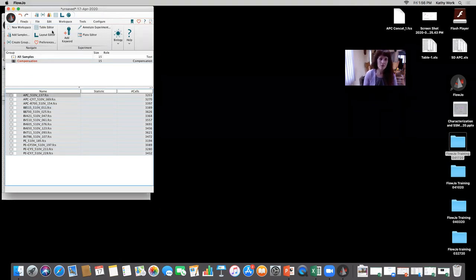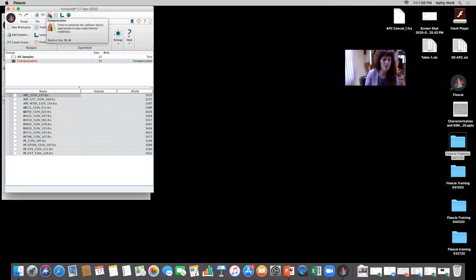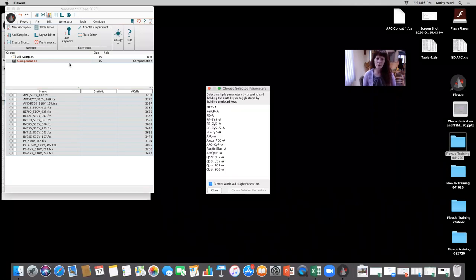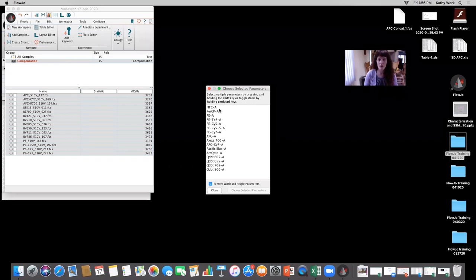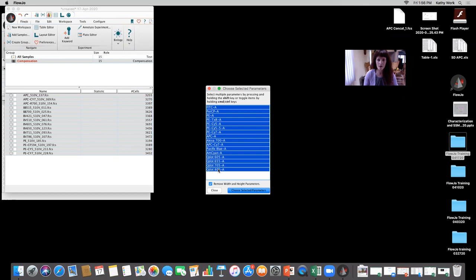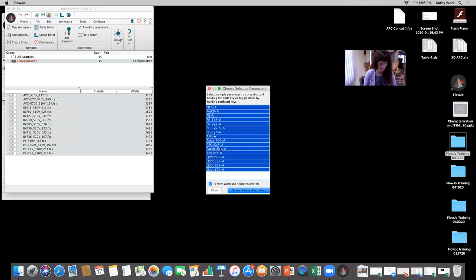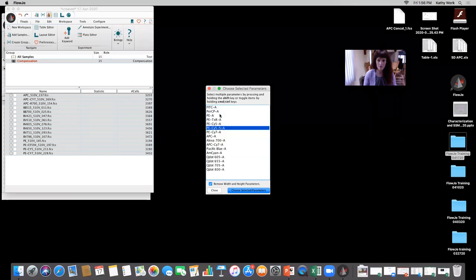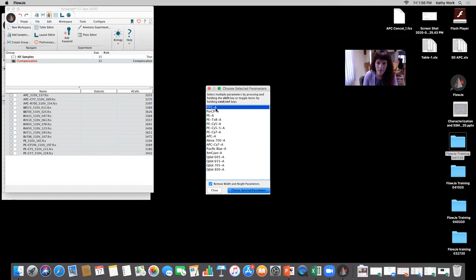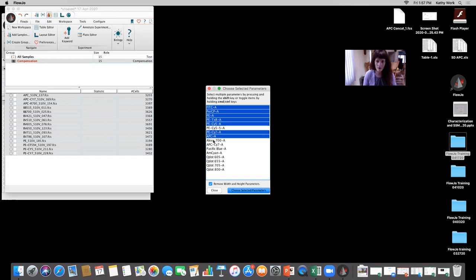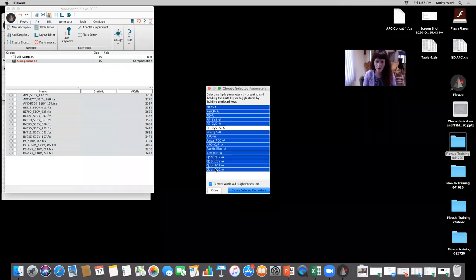For today's purposes, because of limited FCS files, I decided to start off with 510 volts and arbitrarily say those are optimal PMT voltages, just to show quickly how we go ahead and determine the spillover spread. If I drag those files in and come to Compensation, it's actually from the same tool that we can calculate spillover spread. I'll select all those files and bring them into Compensation. I have more detectors open than I have FCS files for, so I need to select just the parameters I have — the only one I didn't have was PE-Cy5.5, so I'll deselect that.